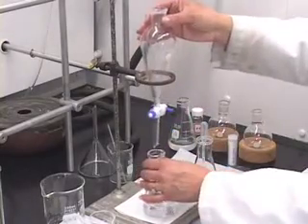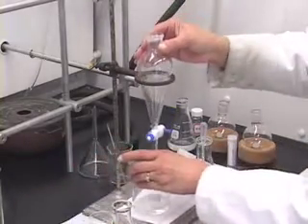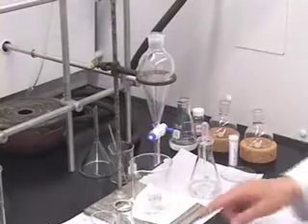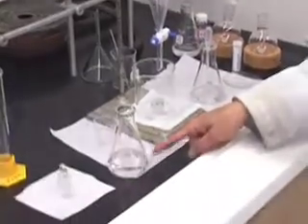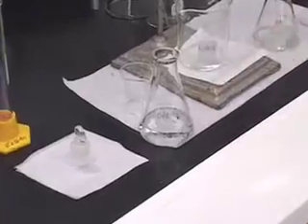Once you have drained all of the organic solution, take out the Erlenmeyer flask. You can keep the waste beaker underneath as usual. Now I am going to add a solid drying reagent to this organic layer.